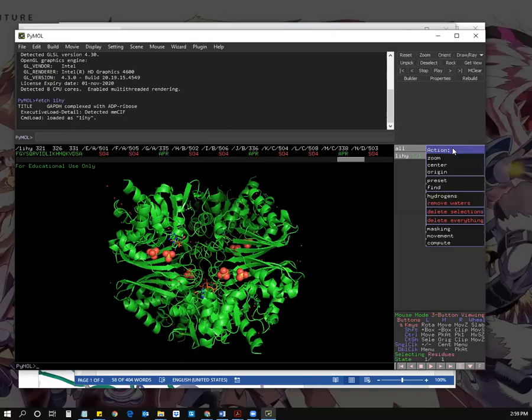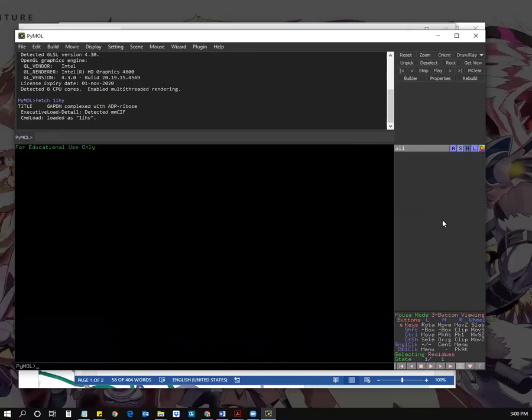So all I'm going to do is select here what I forgot to say on the right side for the control panel. Every single object, protein, ligand, the selection that you're currently on has these 5 different commands available: A for action, S for show, H for hide, L for label, and C for color. So if I don't want to close the program out, but I just want to start with a completely new canvas, I can just go to all and select action to delete everything. When I click delete everything, it's basically like the program just started new again.